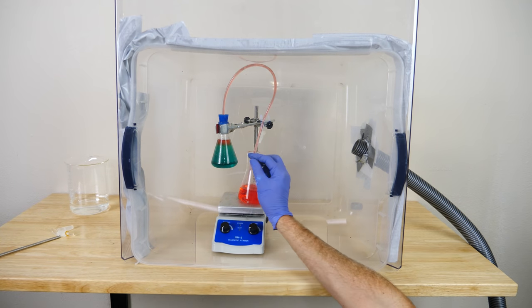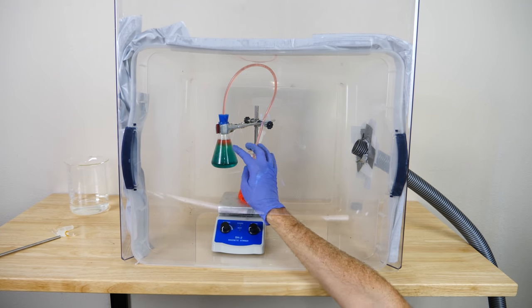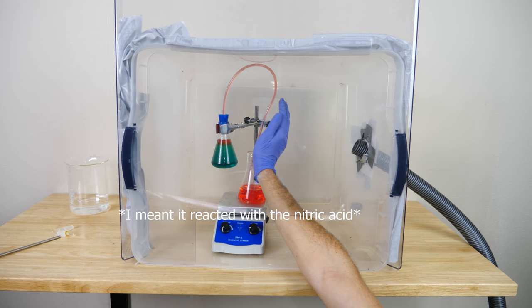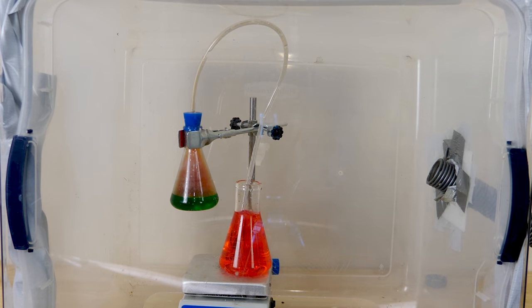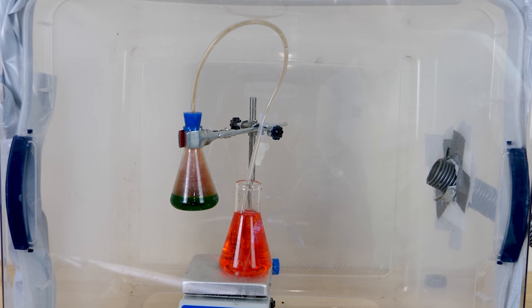Now let's get back to our experiment. The way this worked, when the reaction first started, the copper reacted with the nitric acid and sent out nitrogen dioxide gas that was bubbling through the water. But nitrogen dioxide reacts with water to make nitric acid again. So as soon as it starts bubbling out, it reacts with the water. So the gas reacting with the water reduces the volume, creating a vacuum in the tube that sucks up the water. And it keeps sucking it up the more water you put in there.